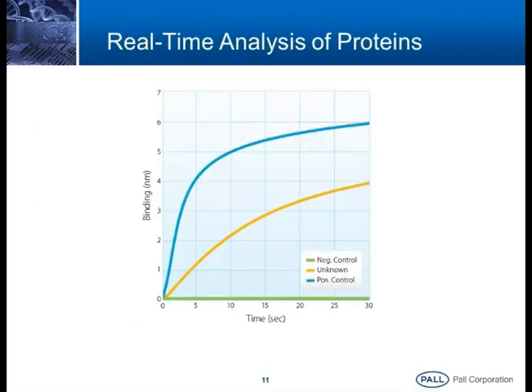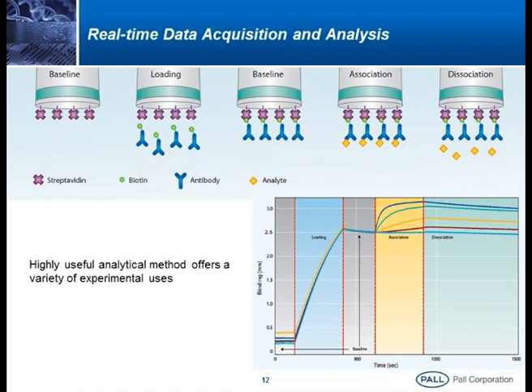So this is what the readout is, how it comes, the example I had shown. Now, kinetics: how exactly are we performing these kinetics?